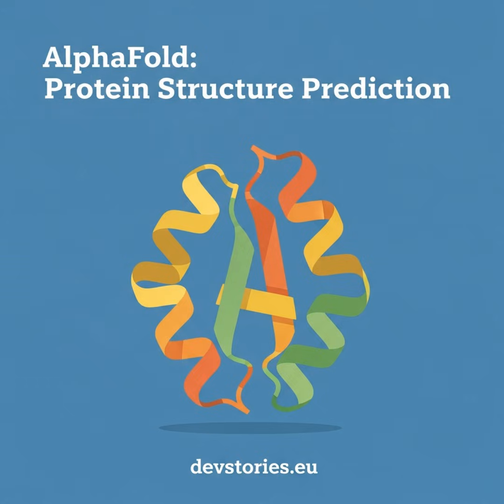AlphaFold, Protein Structure Prediction, Episode 3 of 21. The most powerful feature of an AI model is not always its output, but its ability to tell you exactly when it is guessing. If you look at a predicted protein model and assume every loop and domain is perfectly placed in reality, your downstream experiments will likely fail. To actually use these models safely, you need to understand evaluating predictions, pLDDT and PAE.